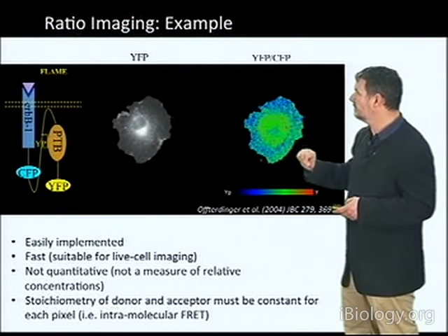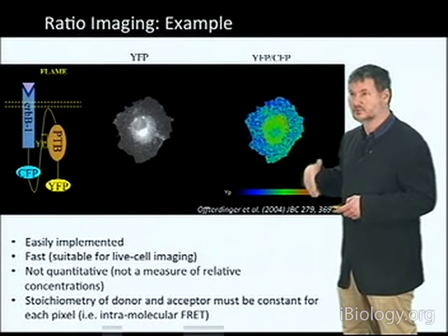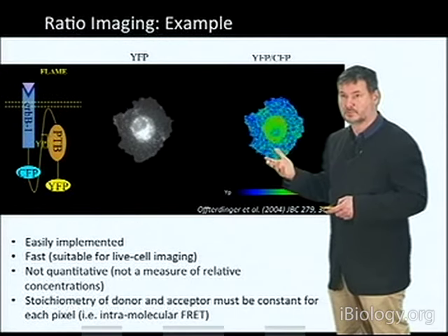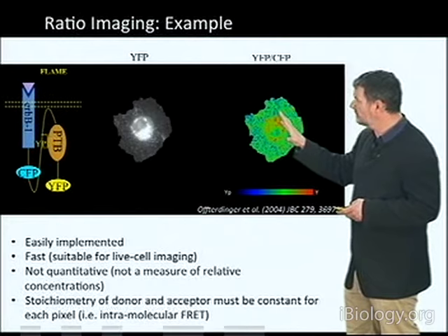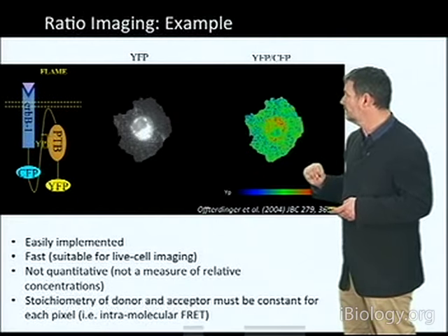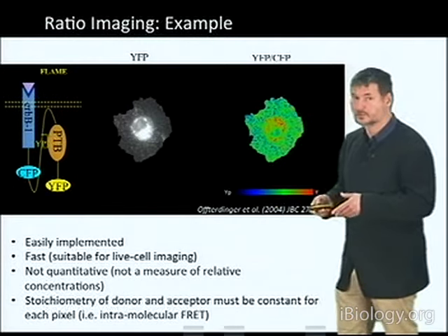The blue represents the phosphorylated receptor. So you see basically there's an area in the cytoplasm that shows active receptor, but there's also an area in the cytoplasm which represents inactive receptor, where it becomes inactivated. And then at the end of the sequence, we actually inhibit the kinase activity and the whole thing shoots back up because we inhibit the kinase activity, which cannot then self-phosphorylate or auto-phosphorylate.